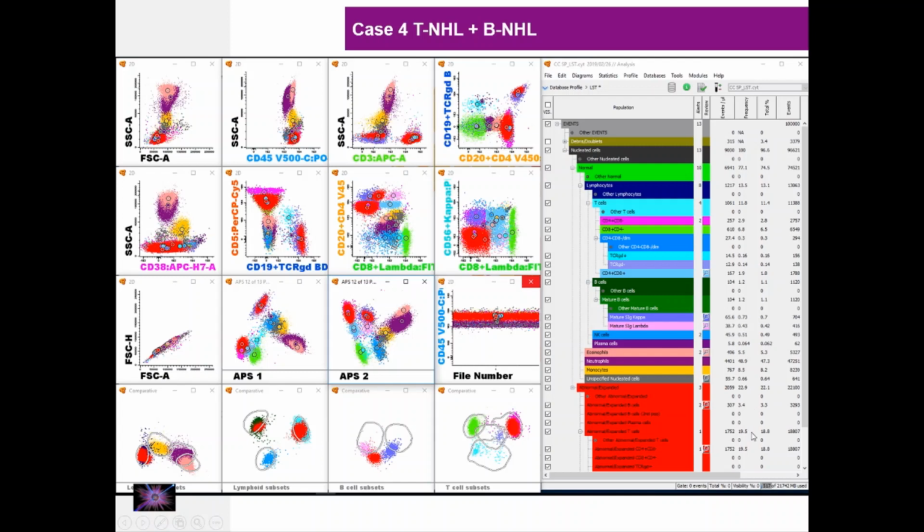It's 19.5% when compared to 3.4% of the whole cellularity. It is important to reinforce this idea that this automated analysis will make you go through every single population, and you are more prone to identify and not overlook any tumor cell population, even though they might be a small cell population.